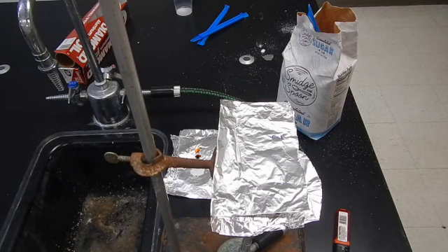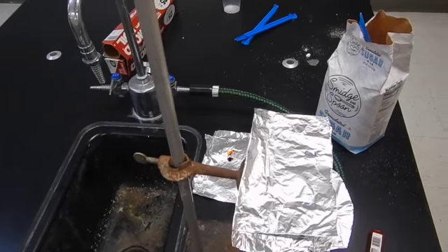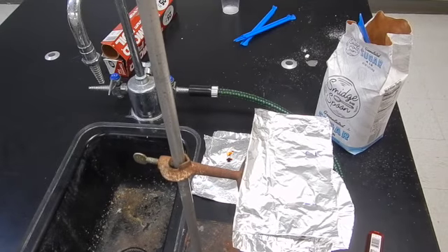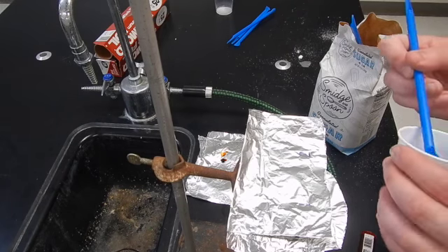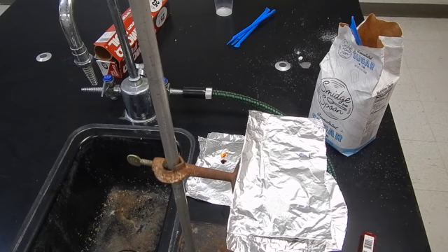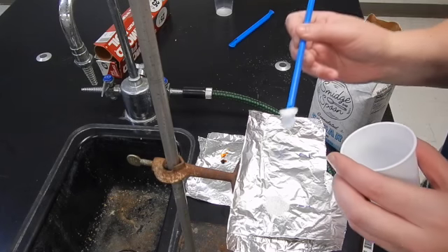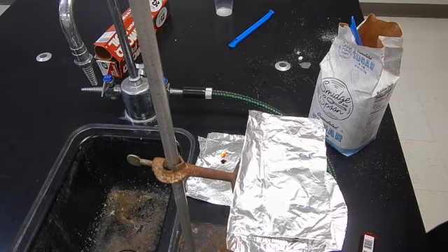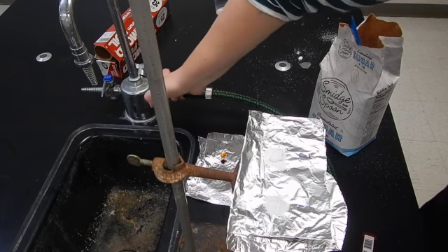Alright, so I will do 2 at a time, just like how we did the sugar and the salt. Unknown 1 will be placed on the left side. Unknown 2 will be placed on the right side. Go ahead and light the Bunsen burner.